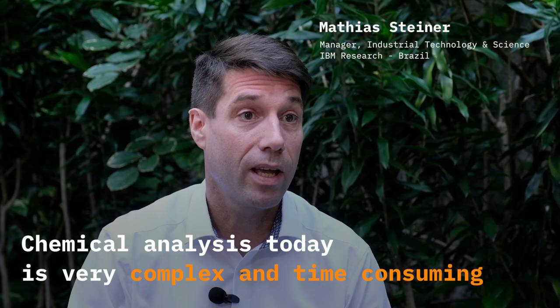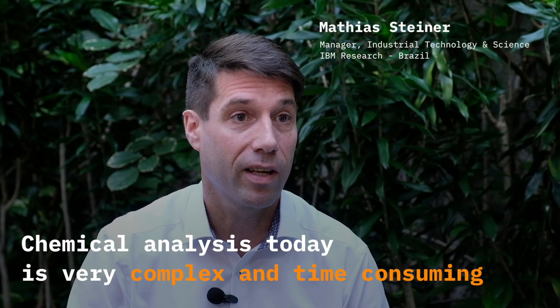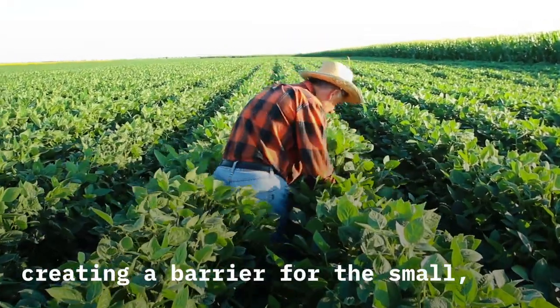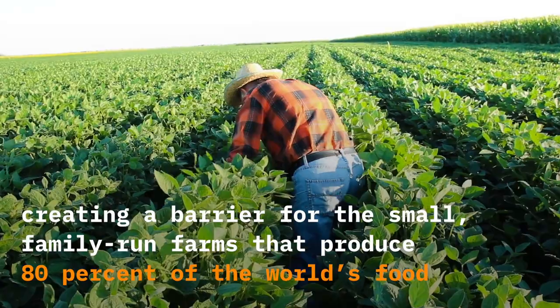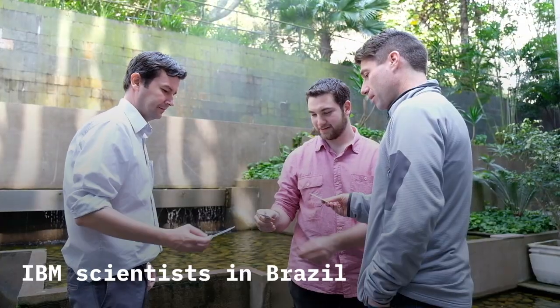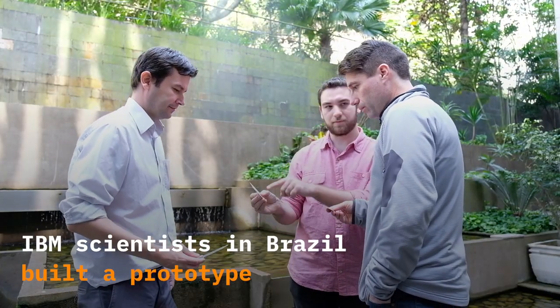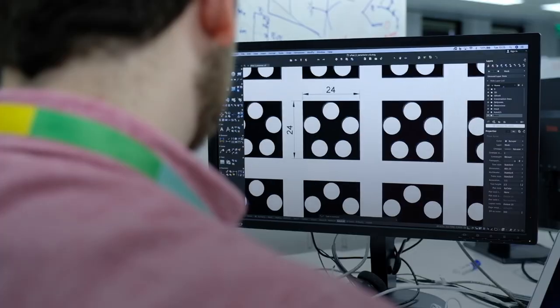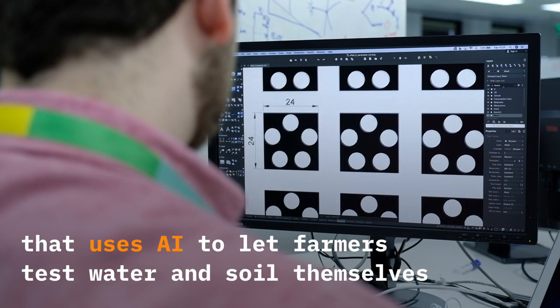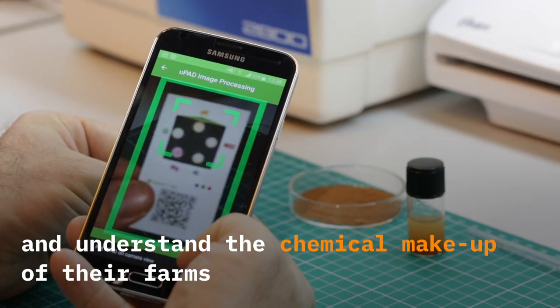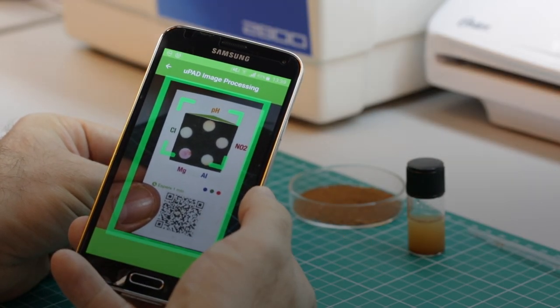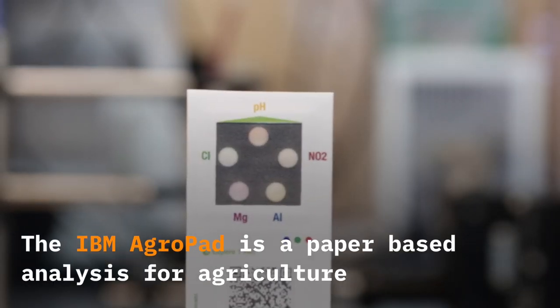Chemical analysis today is very complex and time-consuming. The IBM AgroPad is a paper-based analysis for agriculture.